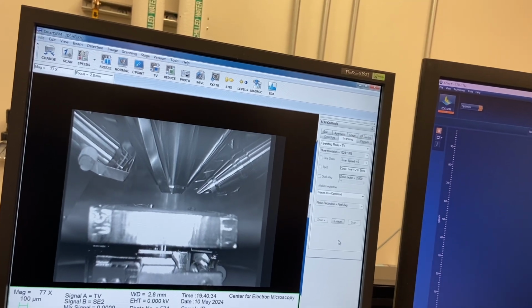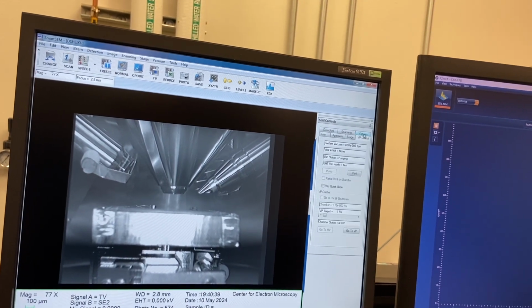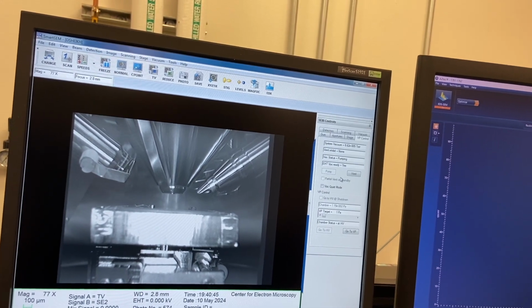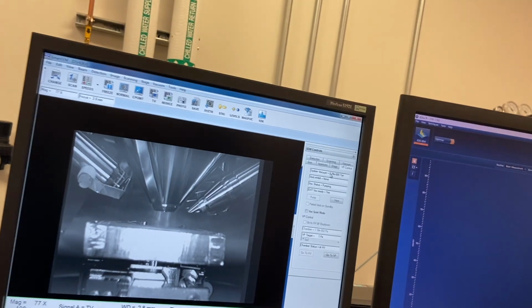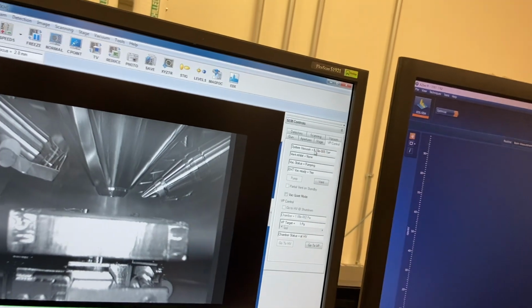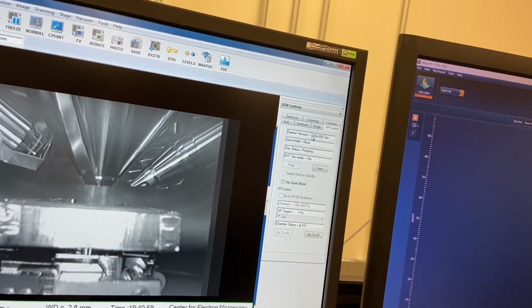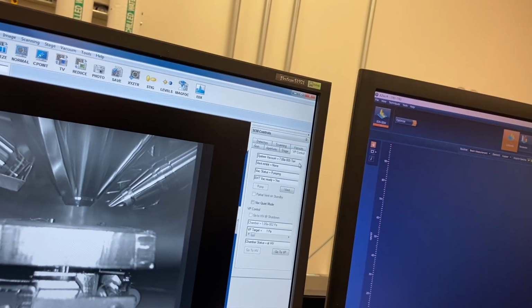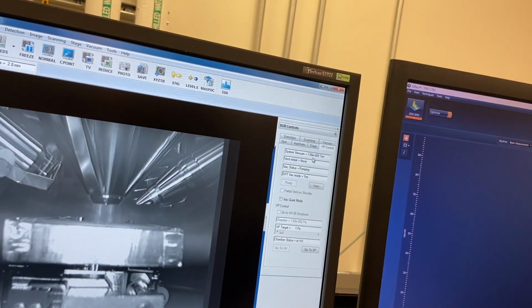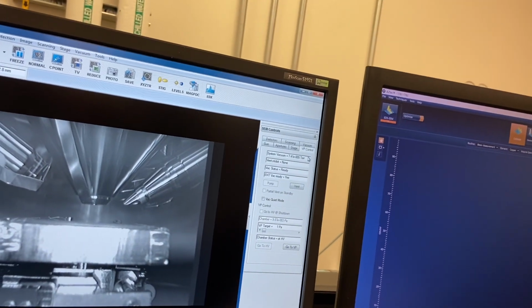And we're just gonna wait. It should be starting anytime soon. Sometimes I check just to see. Still pumping. Okay, there we go. It's gonna make a sound soon. There's a certain sound that I hear whenever I know it's gonna be ready. And sometimes you can also just look at the system vacuum. So we're at what, 8.1 to the -5 torr. It's 10 to the -5. So we're going pretty far down in pressure. All right, so it's about 7 there. That's good. Okay, so we're ready to go.